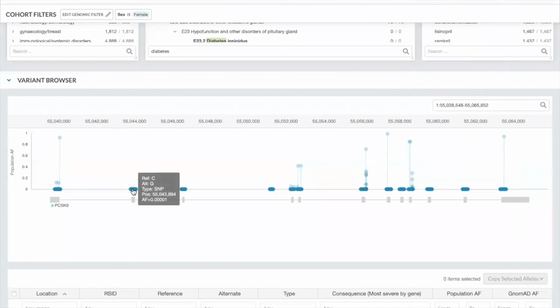In fact, in an exome experiment, you see that most of these variants overlap these exons, because this is typical of an exome experiment, and they are rare. So as you add all the rare variants of these 27,000 people, they become this smudge here over all these exons, which shows that most people have rare variants in these coding locations. And in fact, if you were to take a closer look from a genetics point of view at what the 50,000 first exomes that have been publicly made available look like, almost 80%, if not more, of these variants are singletons. Only one person has any given variant.